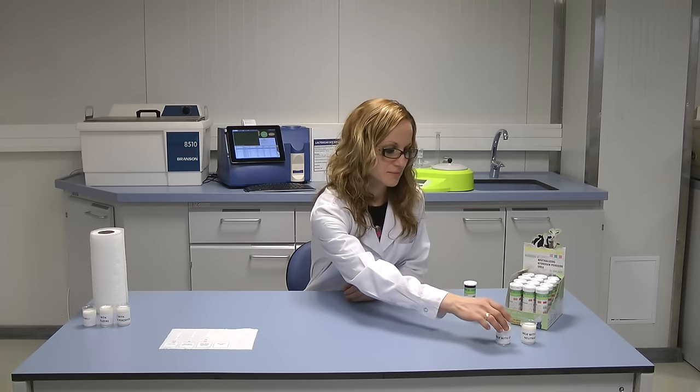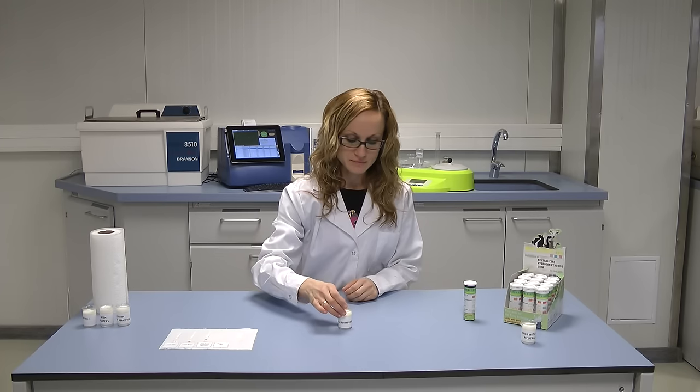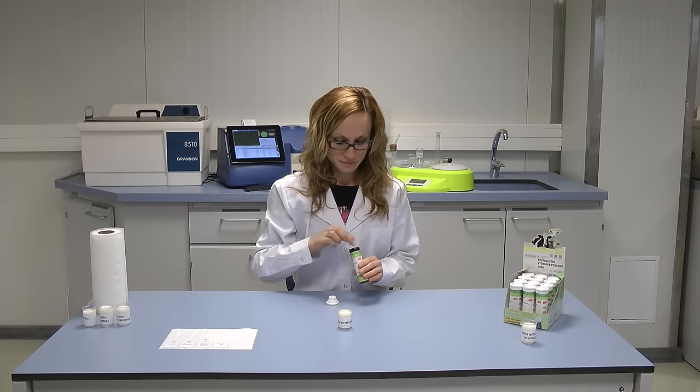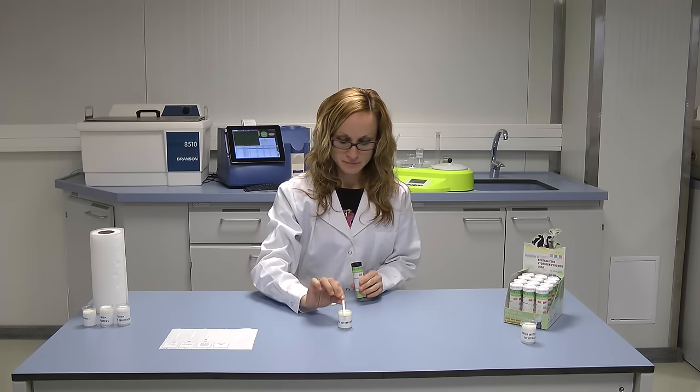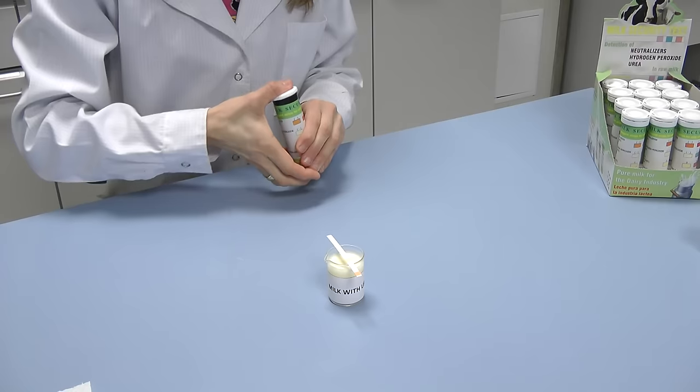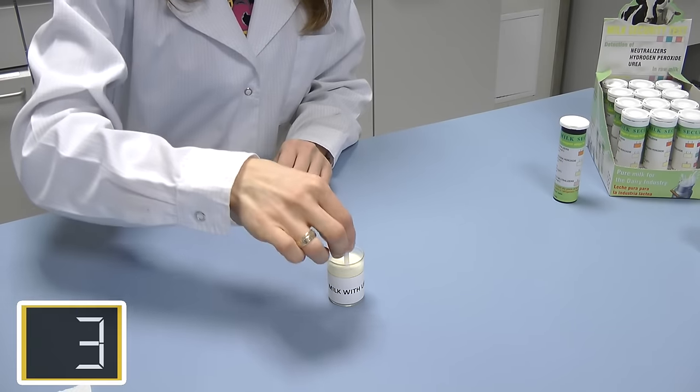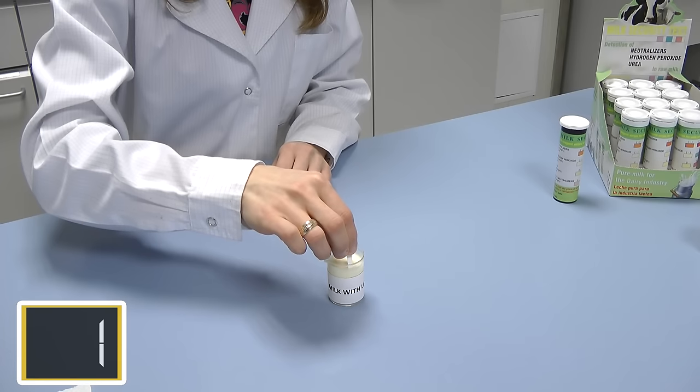Fourth sample is milk adulterated with urea. Urea is generally added in milk for increasing solid non-fat value. It has been proven that urea added to milk at a higher concentration reduces the acidity of the hydrogen ions and increases the pH of the milk.